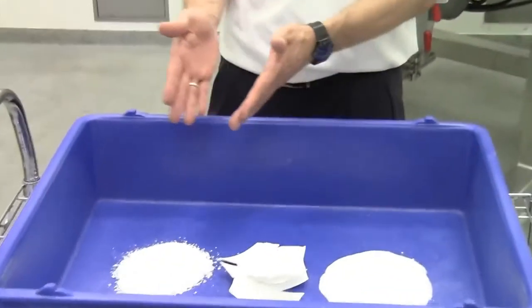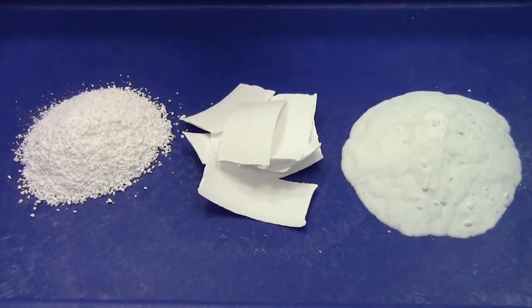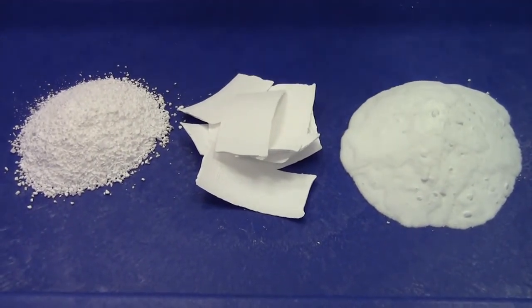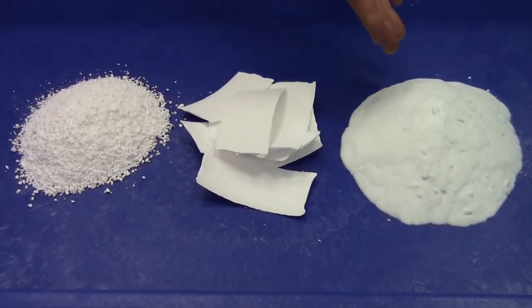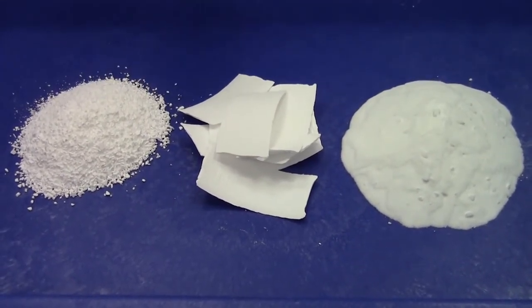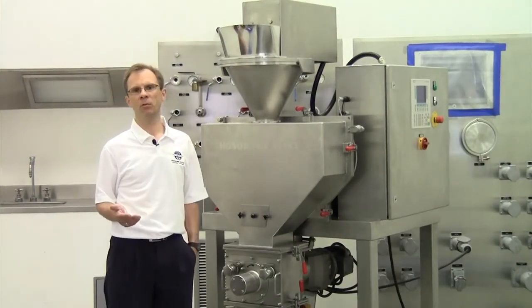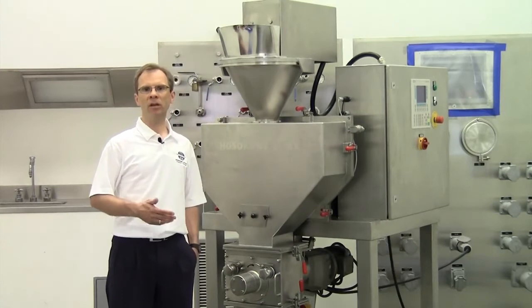Compaction is also known as dry granulation, but compaction is only a part of the dry granulation process. It is normally known as the transfer from a powder to a granular material — the step in between with the roller compactor. The compaction itself takes the powder, produces a ribbon or flakes, and then crushes them in the subsequent flake crusher. Compaction can be used for many kinds of powders such as salt, pharmaceutical mixtures, metal powders, and a lot of chemicals.